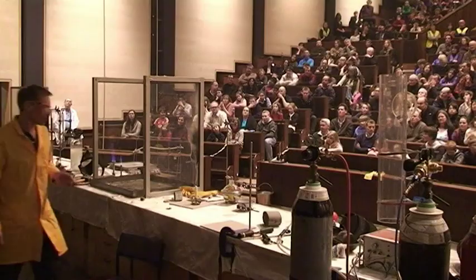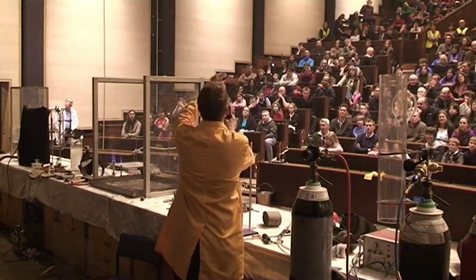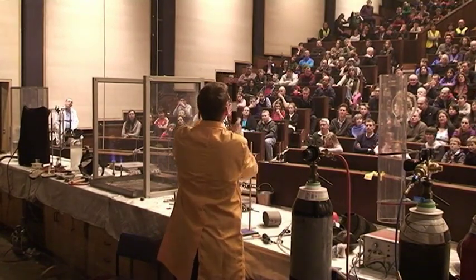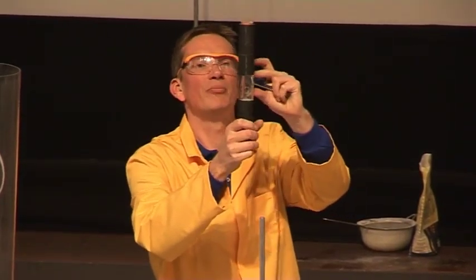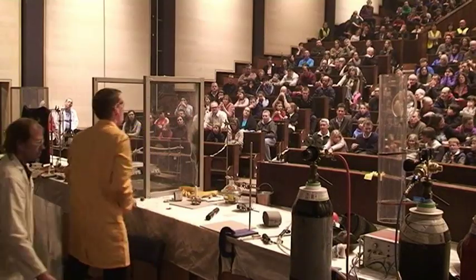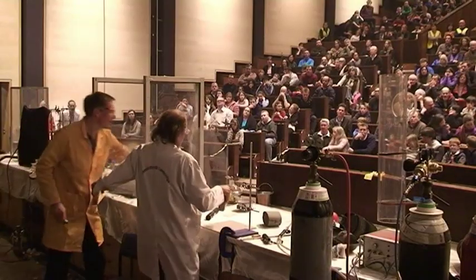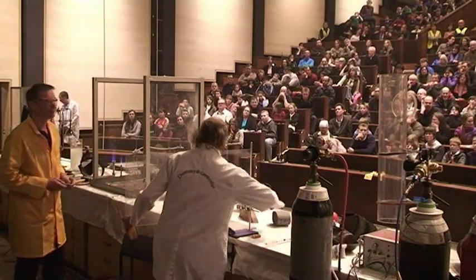And in a moment, we have a tube here that's filled, not this one, this is an empty one, but a tube like this is filled with hydrogen and chlorine. And it's blacked out on the top and the bottom, but not in the middle. And what we're going to do is start this reaction not with a candle, but with some glowing light. We're going to use some magnesium. So the light from magnesium, as we put it near the open window of this tube, should start the reaction.